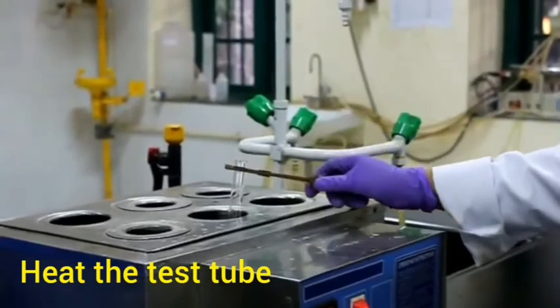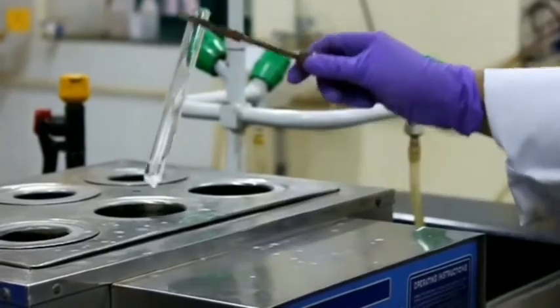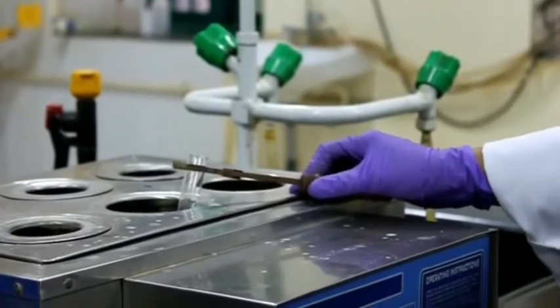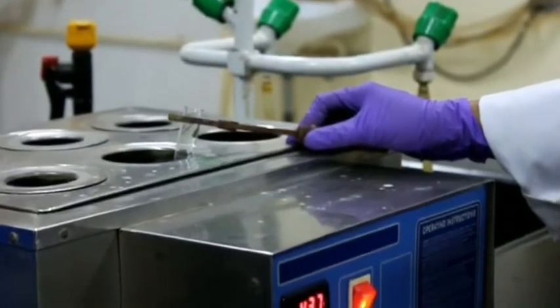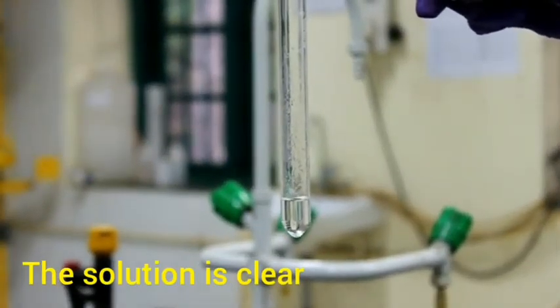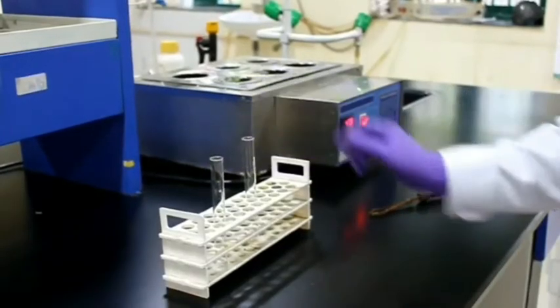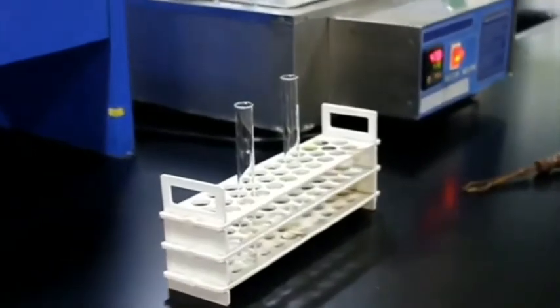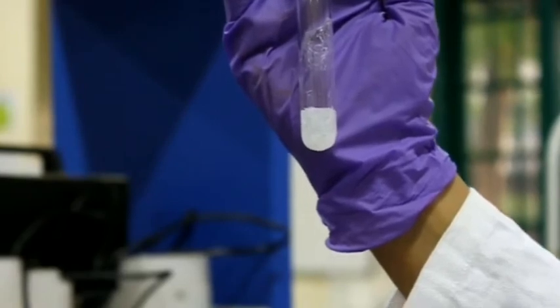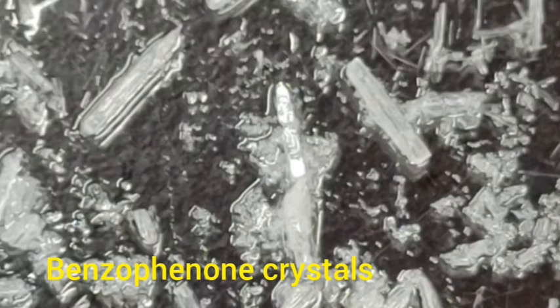So we are heating the test tube in a water bath. Now we can see the solution is clear. Now we keep the clear solution in a test tube rack at room temperature for some time. We can see the benzophenone crystals in the test tube. This is the view of the benzophenone crystals under the microscope.